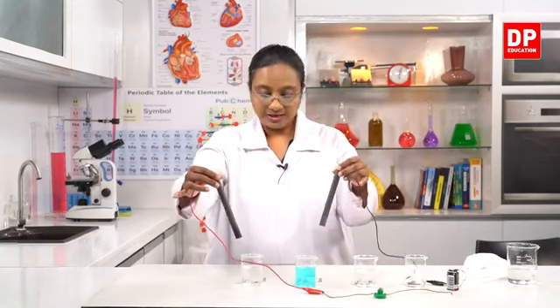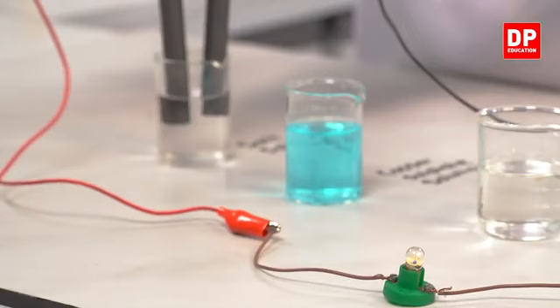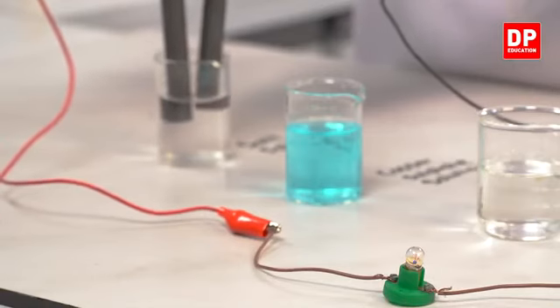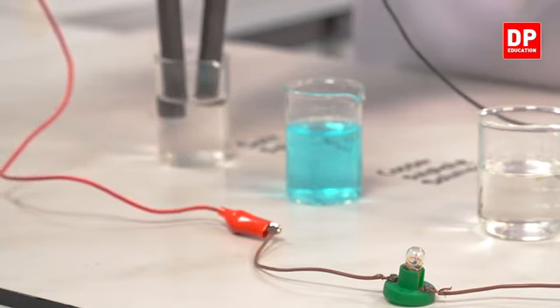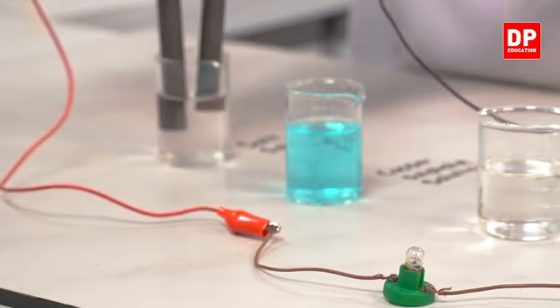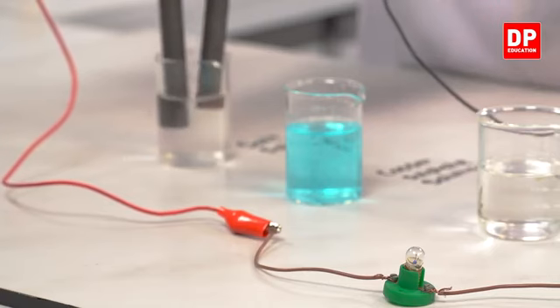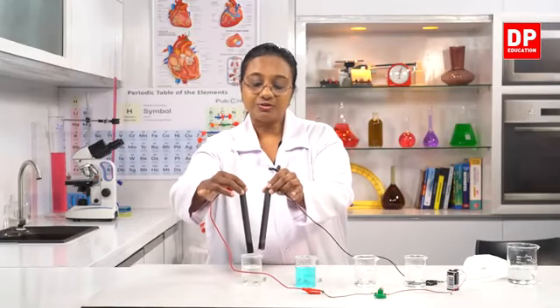So then I will insert it into the salt solution. Can you all see the light bulb? It's lit. So that means salt solution also conducts electricity. And also students, you can see near one of the graphite electrodes, you can see gas bubbles. We will be discussing electrolysis later.